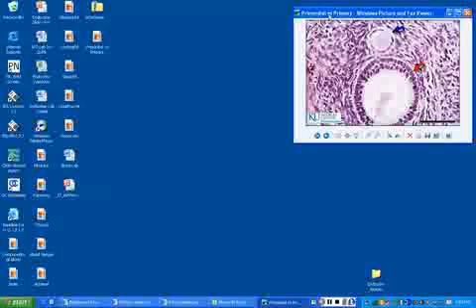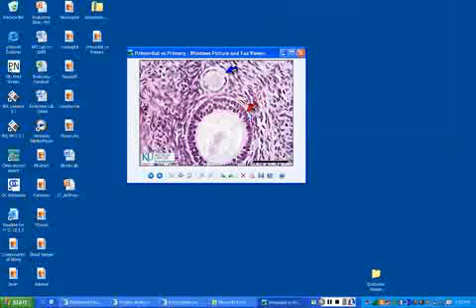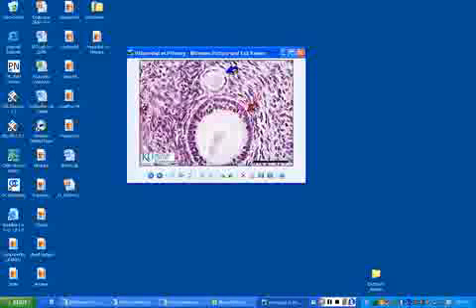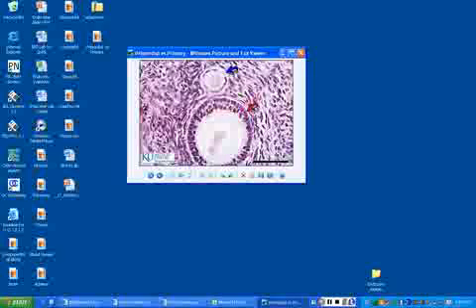Aha. What organ? Ovary. Both of these are called a blank. Follicle. Which one is this? And tell me what's special about the outside. Simple squamous. Nice. And it gets thicker and becomes this layer though? Simple cuboidal, even though that picture's not.